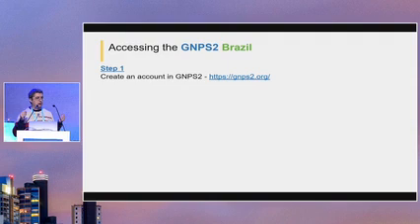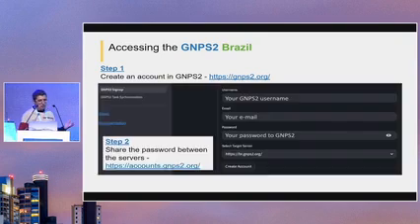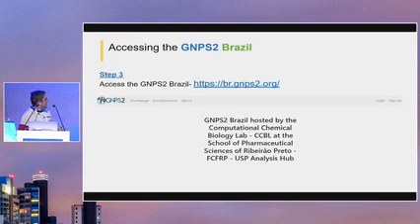So if you are from South America especially, or Latin America maybe, you probably want to link your account to the Brazilian server. We are hosting this Brazilian server at the School of Pharmaceutical Sciences at Ribeirão Preto in Brazil. So you don't need to do this now. I think most people are taking pictures, but we also are going to share this presentation so you can follow all the links, all the explanations we perform here today.